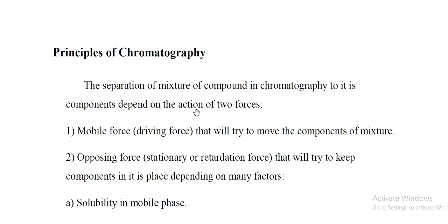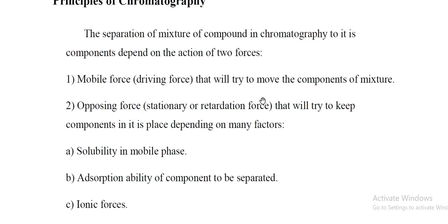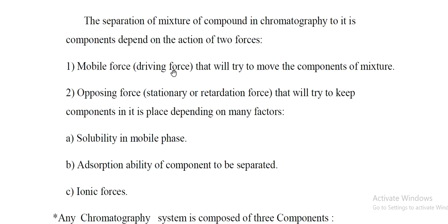Principle of chromatography. The separation of mixture of compound in chromatography to its component depend on the action of the two forces. Mobile force or driving force that will try to move the component of the mixture. Opposing force is stationary or retardation force that will try to keep component in its place depending on many factors.